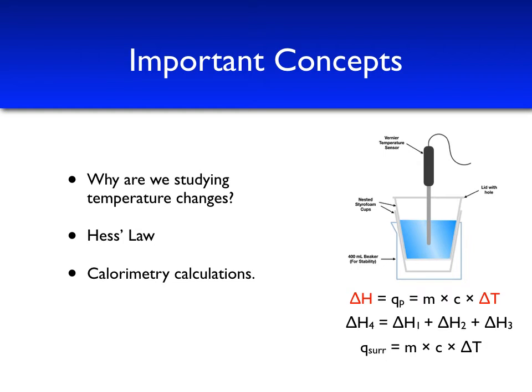We then use the first law of thermodynamics to figure out the delta H. We notice from the first law that Q for the system plus Q for the surroundings must equal 0 for energy to be conserved. This implies that Q for your reaction must equal minus Q for your surroundings. And we also know that Q for a reaction will be about equal to delta H for that reaction. You'll compare this value with a value calculated by standard enthalpies of formation.